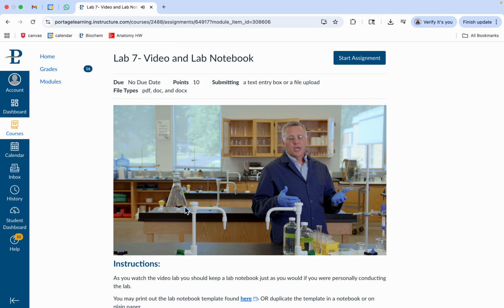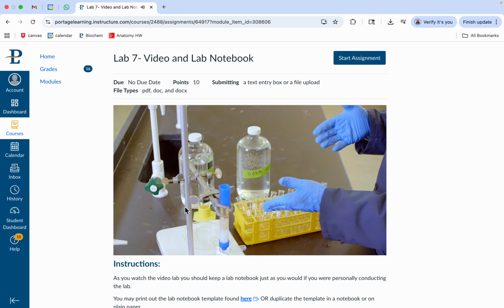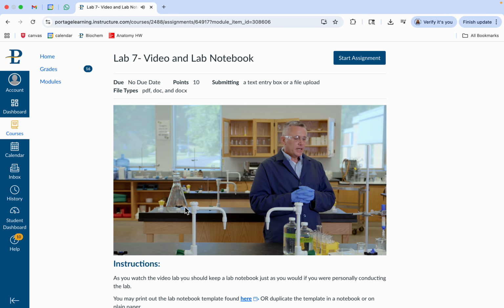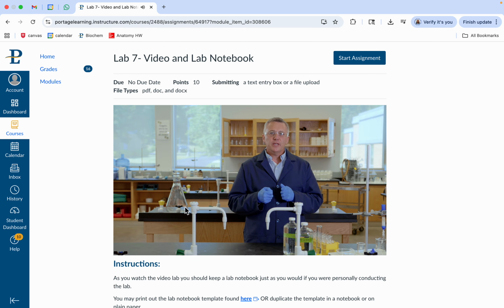And this will be enough concentration difference that will allow the GOT to then be eluted, or kicked off the column. All right? And so we're going to basically collect 2 milliliter fractions, and so that'll be a total of 30 tubes because we have 20 milliliters of this, 40 of this, so we have 30 tubes. And as we do that, one of the things we're going to do is test for GOT activity. We're going to do what we call quick GOT activity on every other tube.